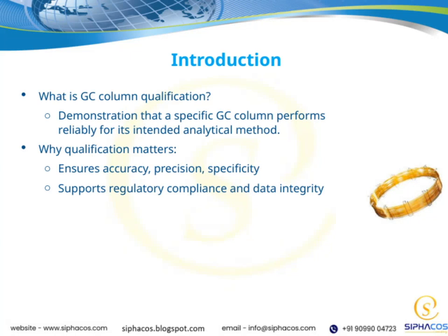Let's take a moment to explore what GC column qualification really means. Essentially, it's about demonstrating that a specific GC column consistently performs reliably for its intended analytical method. This isn't just a one-time check. It's a thorough demonstration to ensure the column's performance is up to standard.